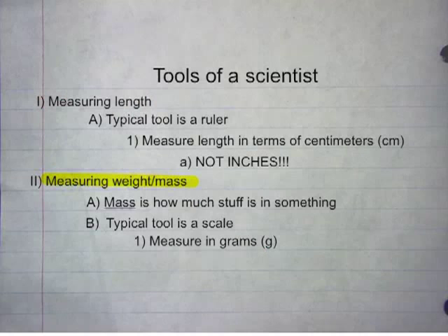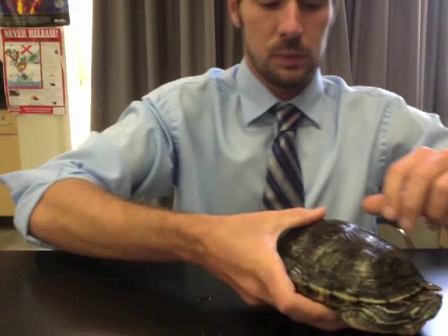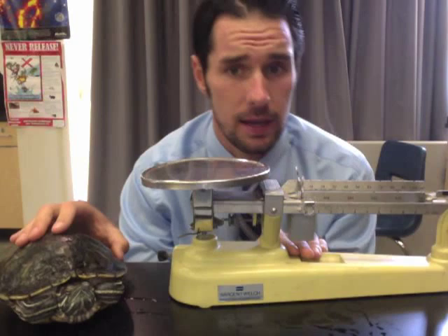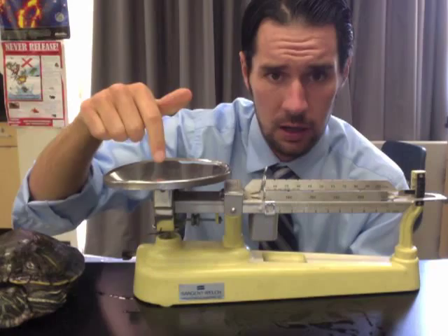Measuring weight and mass. Mass is how much stuff is in something. The typical tool is a scale, measured in terms of grams. Now, if I wanted to measure mass, Babrita's a big girl, so I'd use a triple balance beam scale. You put the object you want to measure here, and then adjust the weights until this piece right here lines up with the zero mark.